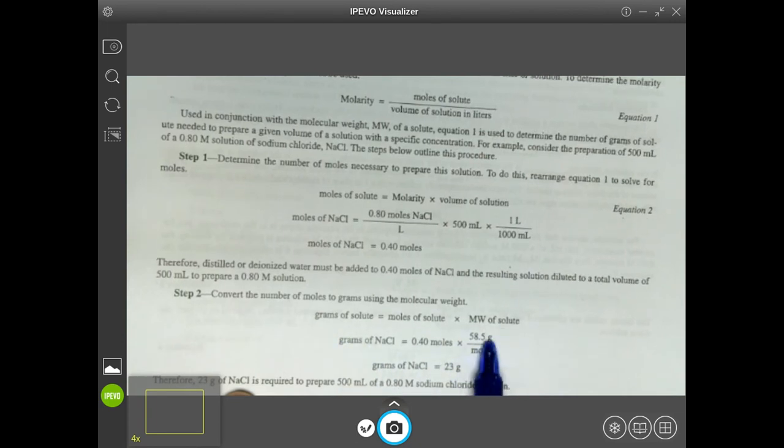And then depending on the substance, you have to figure out the grams, because we don't really measure things out in real life in moles. So to figure out the grams that you need, you're going to take the moles and convert from moles to grams using the molar weight, adding it all up from the formula, right?